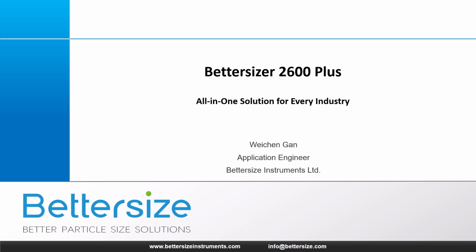For years, the Bettersizer 2600 has been a benchmark for particle size analysis: reliable, precise, and robust. But industries evolve, and the demands for wider versatility and higher efficiency are growing every day. Today, I'm proud to introduce the evolution of that legacy. This is the Bettersizer 2600 Plus. We call it the all-in-one solution because it doesn't just measure, it adapts to every challenge your lab faces.